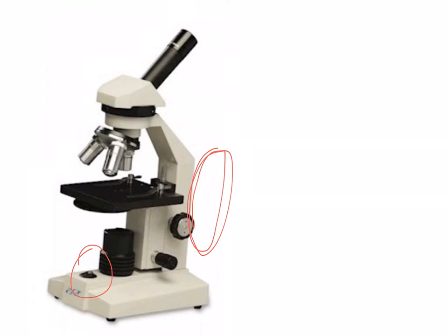Before you start, make sure the microscope is in the correct condition: the stage should be in the very bottom position and the low power objective should be clicked into position. Place your microscope slide on the stage, then use the coarse adjustment knob — the larger knob — to focus the image. Then use the fine adjustment knob to sharpen the image. When going from low power to medium power, rotate the revolving nosepiece and use the coarse then fine adjustment knob as needed. When going from medium power to high power, never use the coarse adjustment knob, as it can potentially break the slide and damage the lens.